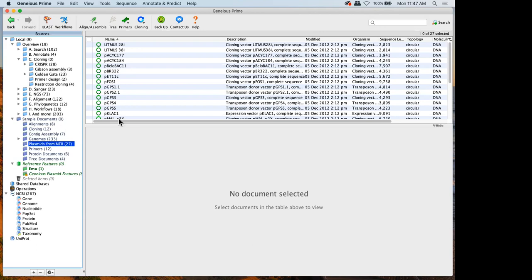So I'm not going to cover cloning at the moment, unless we might have some time at the end if there's requests for it. There are some tutorials on the website. Instead, we're going to jump a little bit and talk about alignments in general in Geneious. We're going to talk a little bit about NGS. We'll talk about just multiple sequence alignments. We can maybe cover some Sanger sequencing. I'll show you a quick taste of workflows as well, because they tie particularly nicely into this.